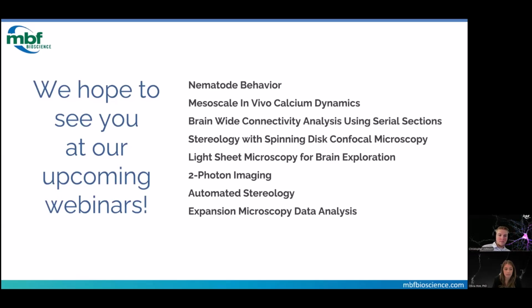Yeah, another option would be adding a bit of logic after this, because we do see that when we detect the peak, and then when we stop detecting the peak, is very close to the end of the peak. So the nice thing about these types of real-time processing algorithms is that they're easily stackable if you have other constraints.